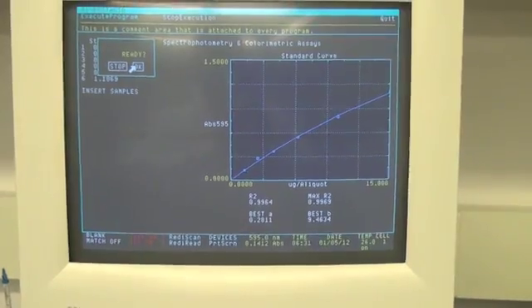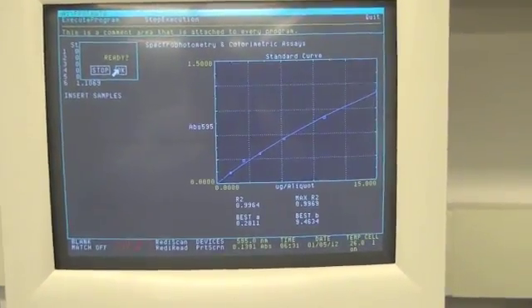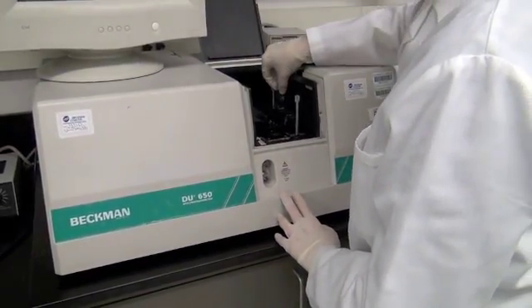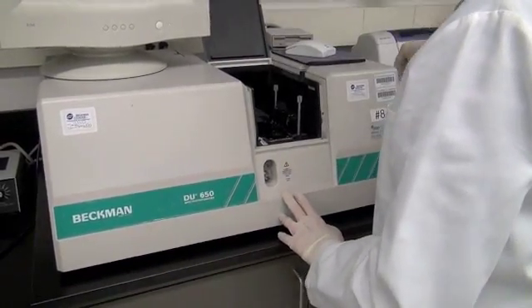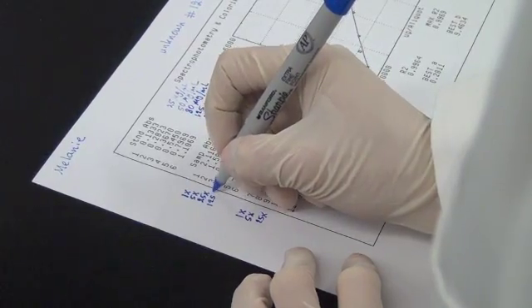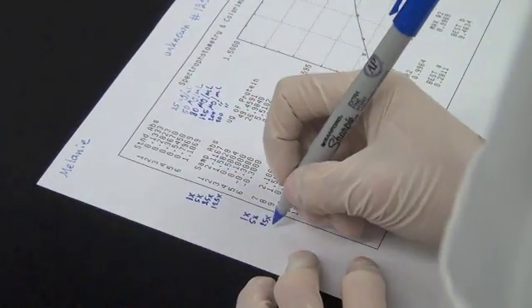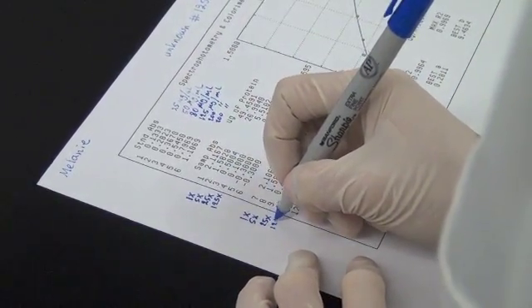When you have determined that your standard curve appears acceptable, then place the first set of unknown samples in the spectrophotometer based on the order in which you added the dye. Be sure to remember the order and record this on your printed datasheet after you have completed the assay.